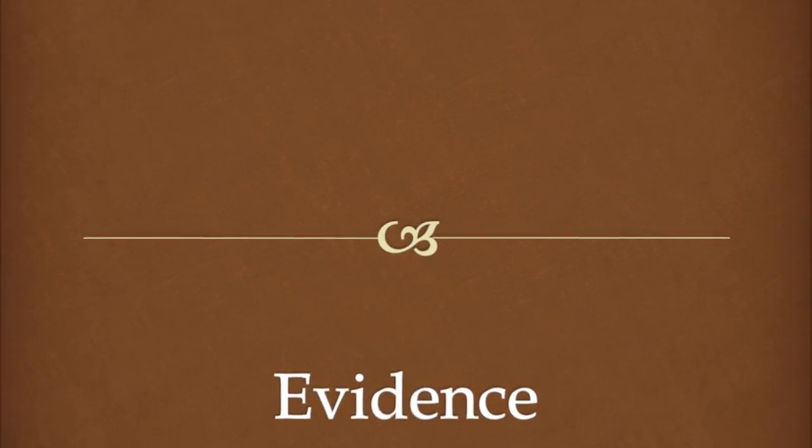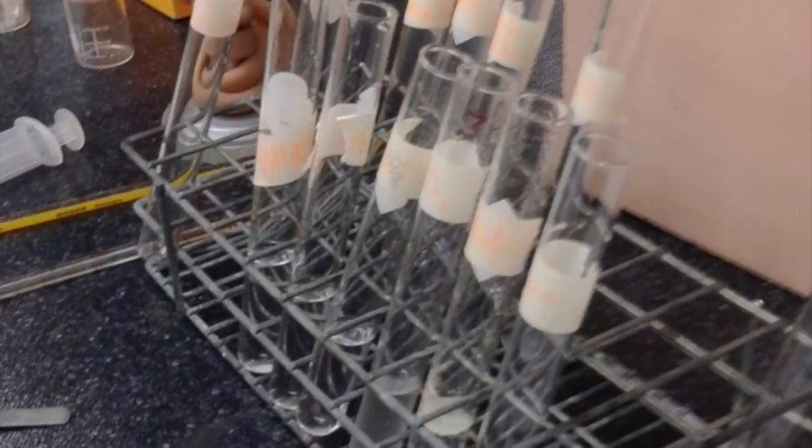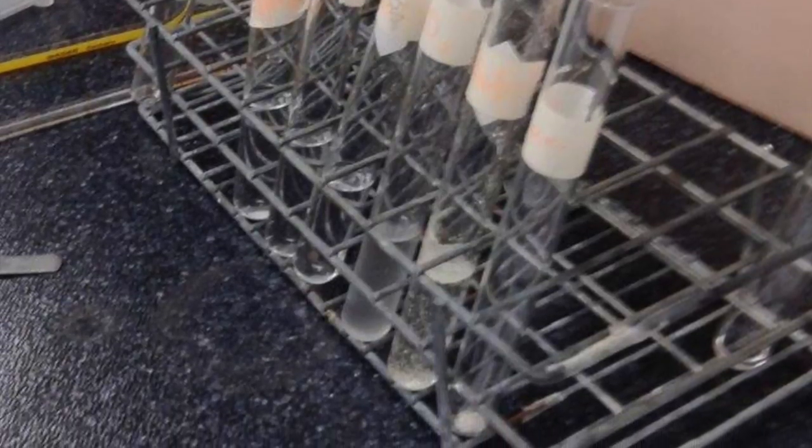The second one was to find whether an element was metal or non-metal, depending on its physical properties. What the team did first was check the solubility of some compounds, first in water and then repeat this, but now in CCl4.